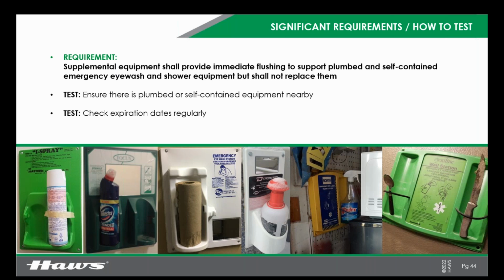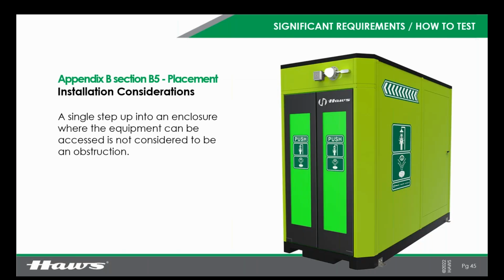Okay, so if you have a hazard, you are exposed to something, you could grab that bottle, immediately treat your eyes while you are moving towards the shower and eye face wash that can provide full 15 minutes nearby. These are not to be used by themselves. Okay. A couple installation considerations.